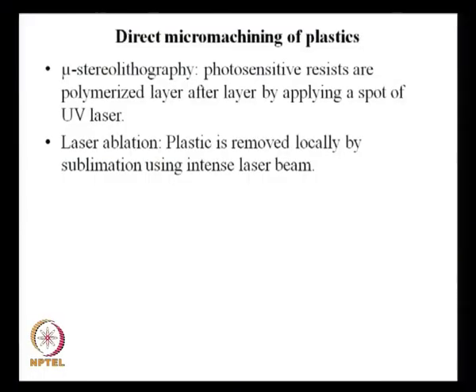However, these techniques are not that widely used. The techniques that are most widely used are hot embossing, casting, molding, or micro injection. These are the more popular techniques. However, microstereolithography and laser ablation are some of the techniques that are available.